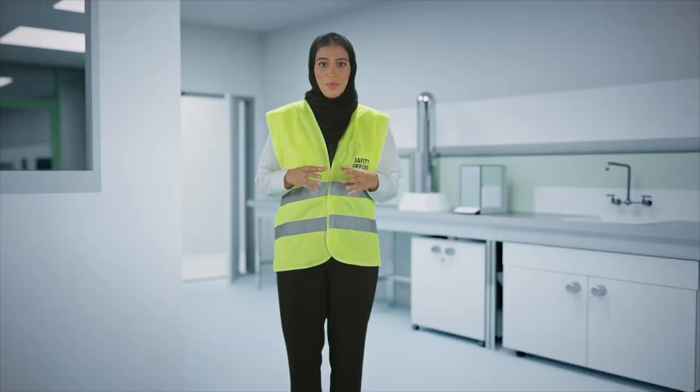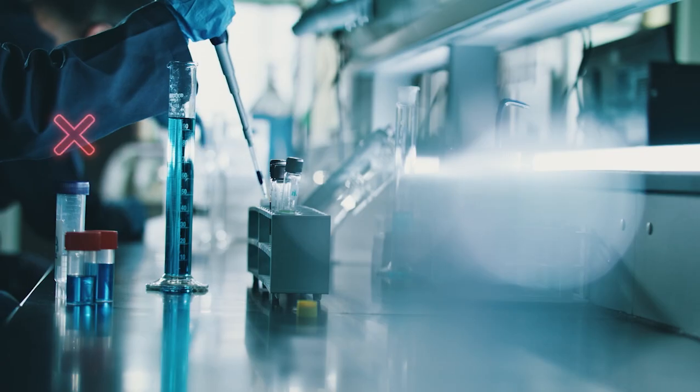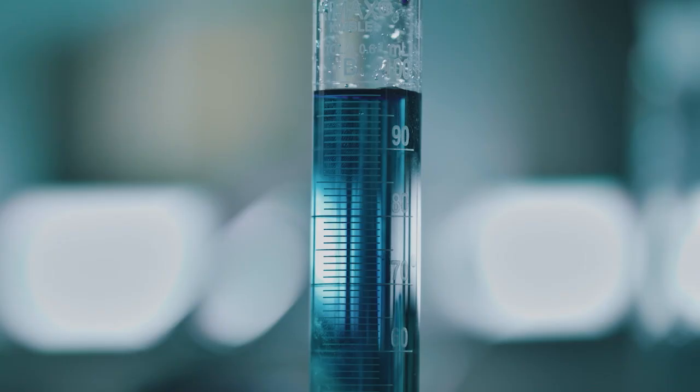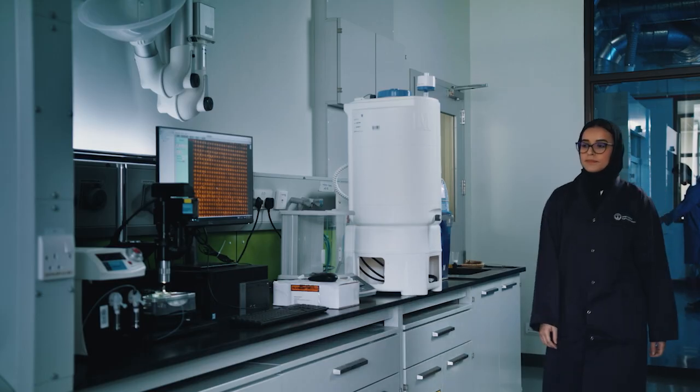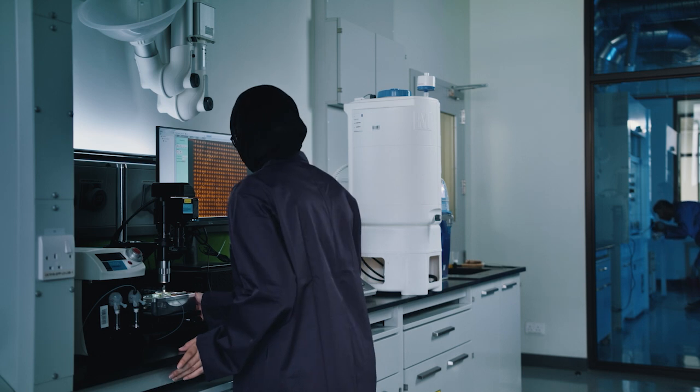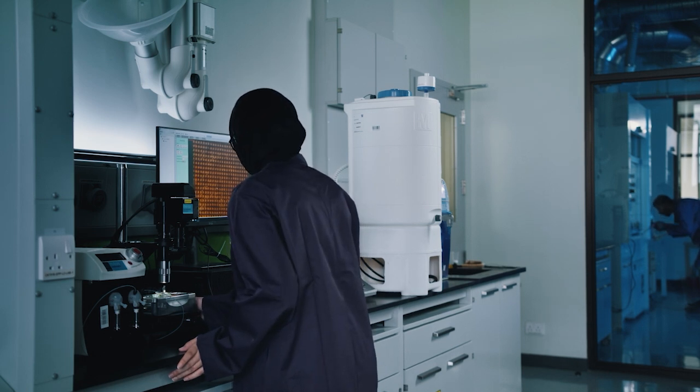Chemical spills are probably the most common laboratory incidents. Good housekeeping habits will help you avoid spilling chemicals. Keep laboratory items well away from the edge of your laboratory bench or another workplace. Walk slowly and carefully in the laboratory. Rushing may cause you to bump into other students or into cabinets and laboratory furnishings.